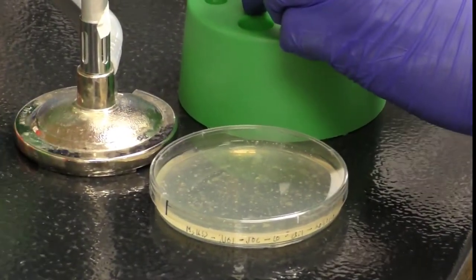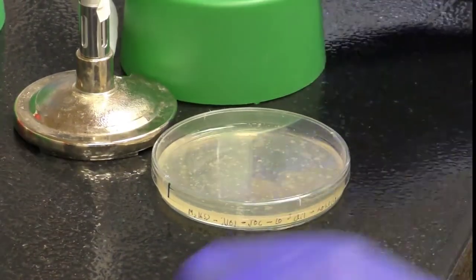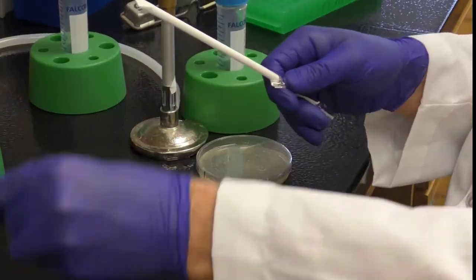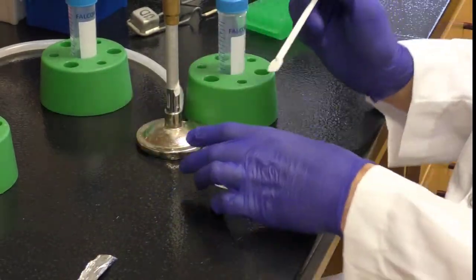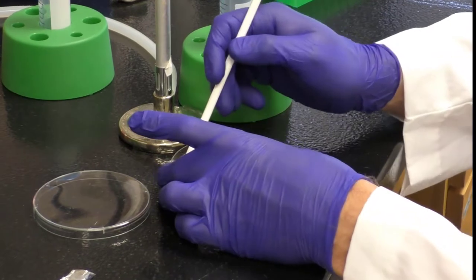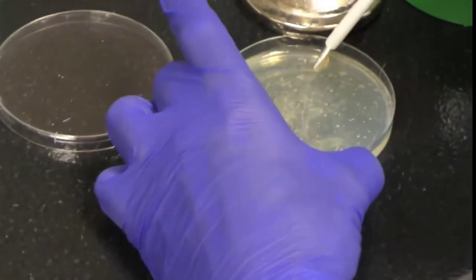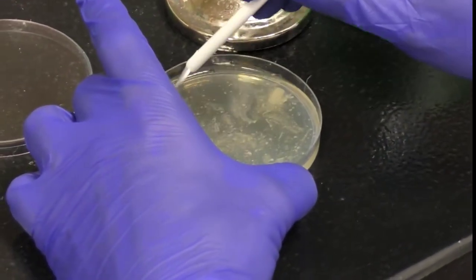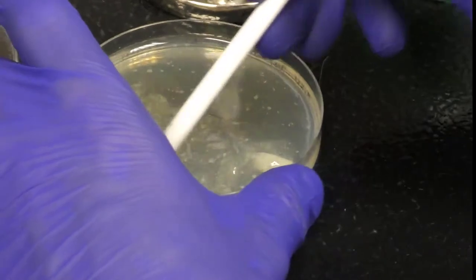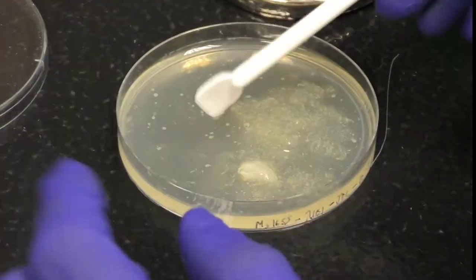I have two tubes. The second one will be used after the spin to put the lysate in once it's ready. And this is the one that I will put the agar and the buffer into. So we take a sterile scraper and we can use whichever end you prefer. It makes no difference. And the trick here is just to gently scrape. You don't want to gouge the agar underneath. And make sure you get the sides as well. So you can turn and just scrape until you've scraped gently the soft agar off of the entire surface of the plate. Again, just be gentle here. You don't need any force and you don't want to gouge into the agar.